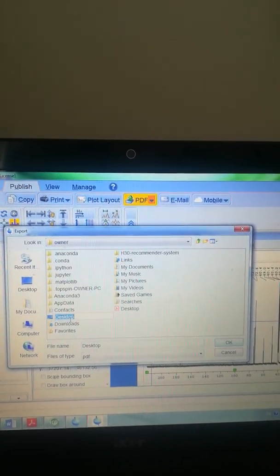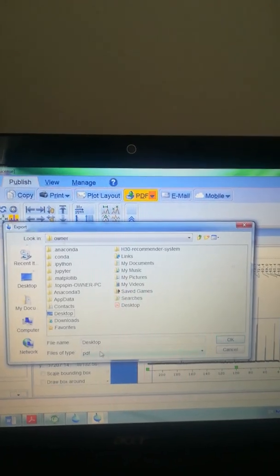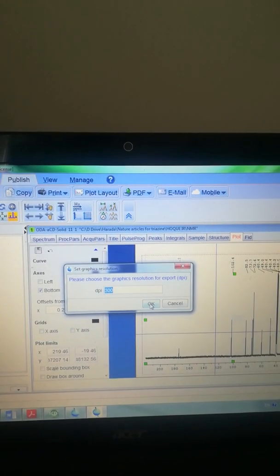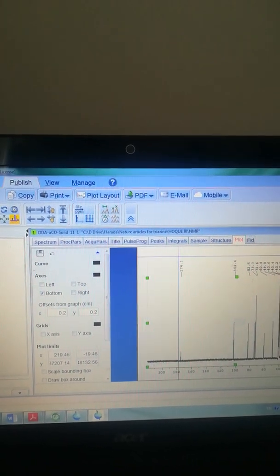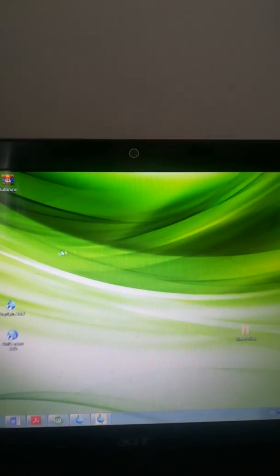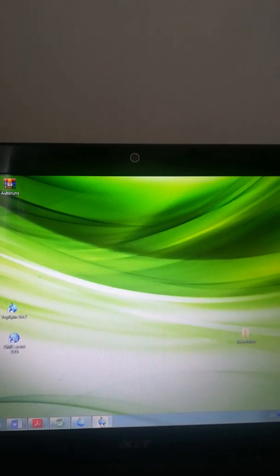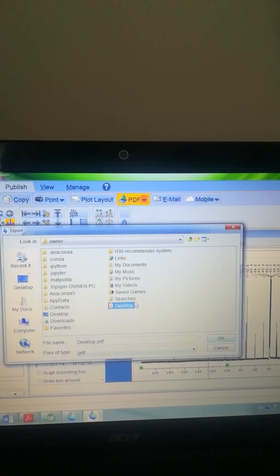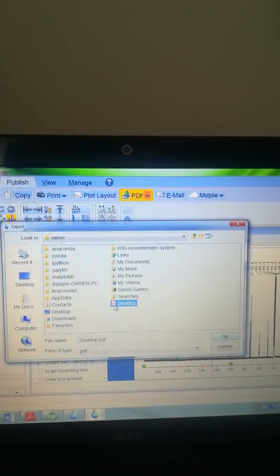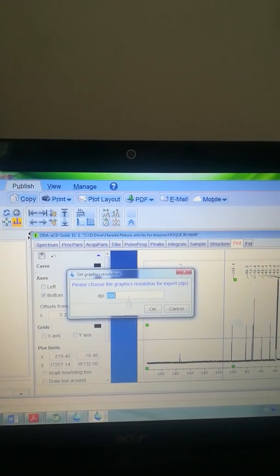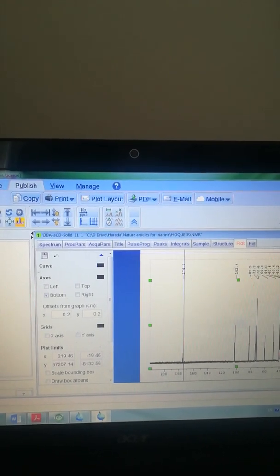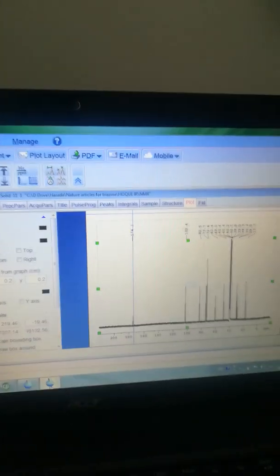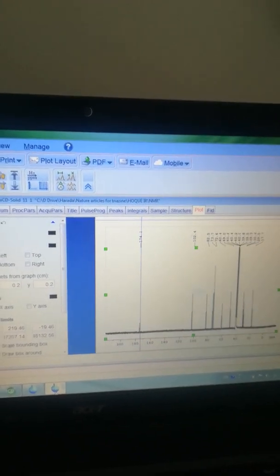The picture resolution is 300 DPI. I'd like to save it to the Desktop. Select the desktop location and put the filename. You may need to select a previously created PDF and click OK. By this way you can save the PDF and copy the spectrum from the PDF and put it into your manuscript.